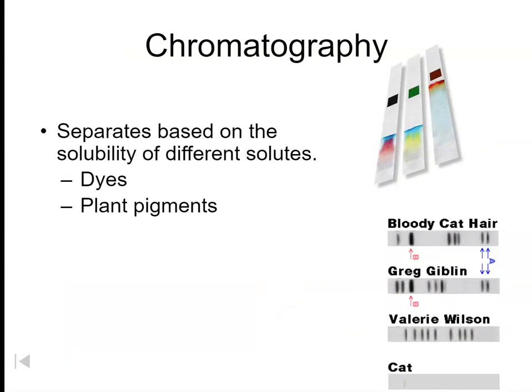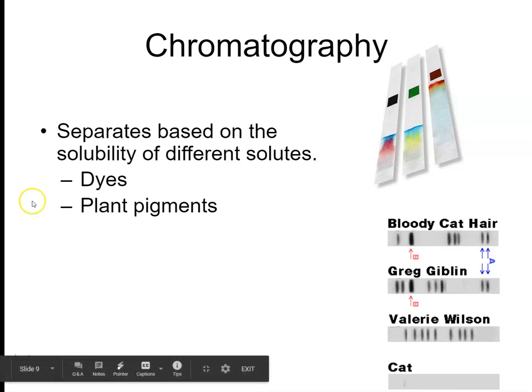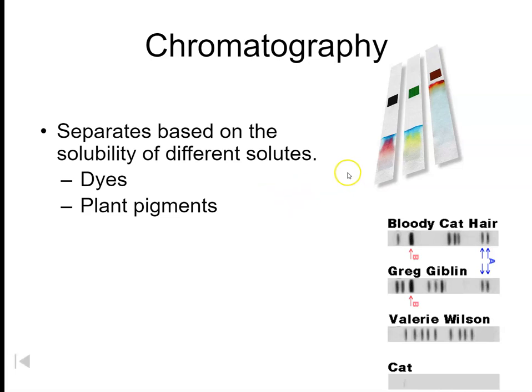One of the labs that we do spend a little time on is called chromatography. You're going to see this during Science 9. You'll again see it in Biology 10 next year when you guys do some work with biological pigments. But it works on the fact that some materials are more soluble than others. So solubility is the physical property. And so when you put a substance into a solution, we know that some materials are soluble.